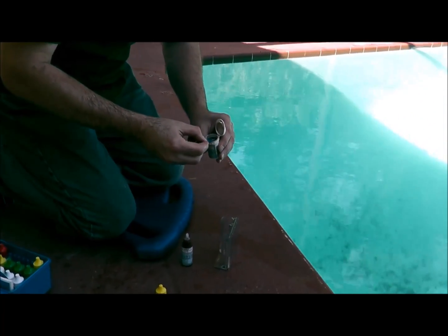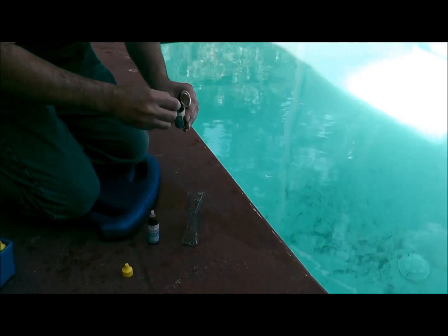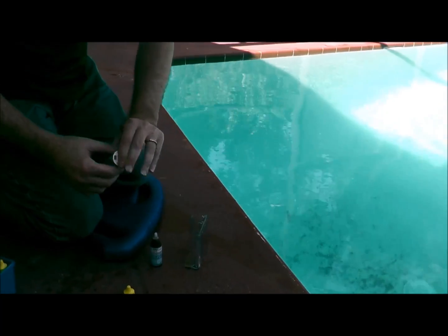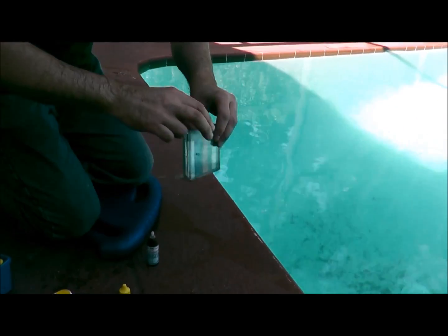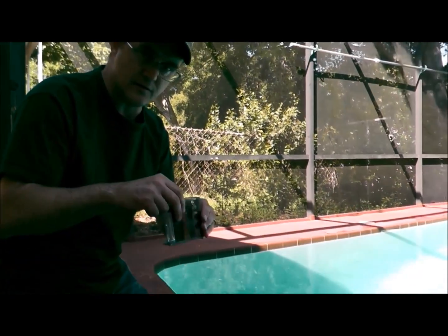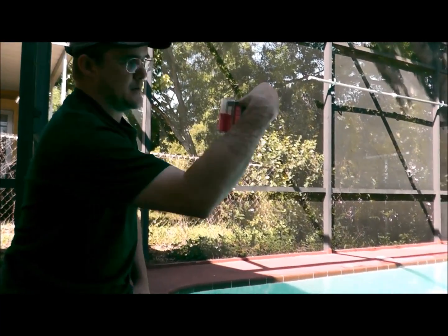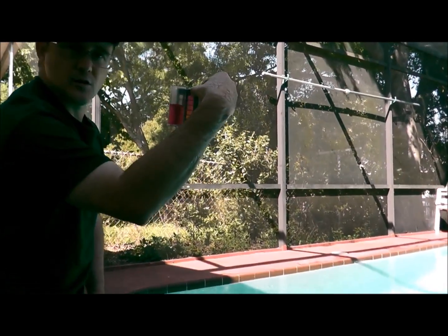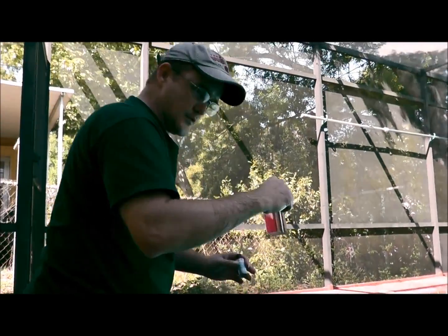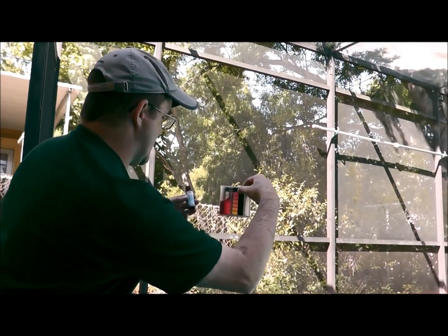Now I'm going to take two scoops of the powder and put it in the sample — and that turns pink. Remember, don't hold it down and slosh it back and forth; you want that swirling technique. It turns pink, so that means chlorine is in there.